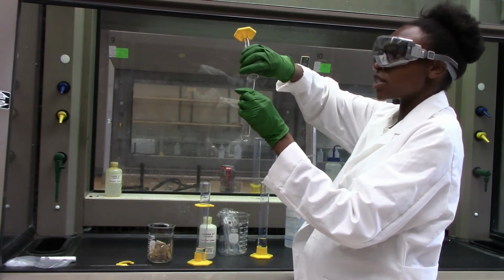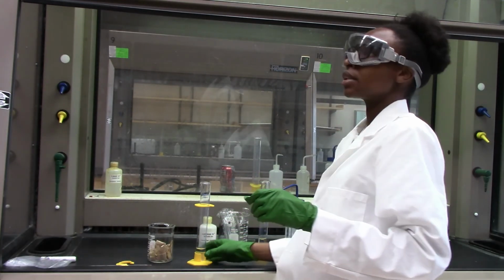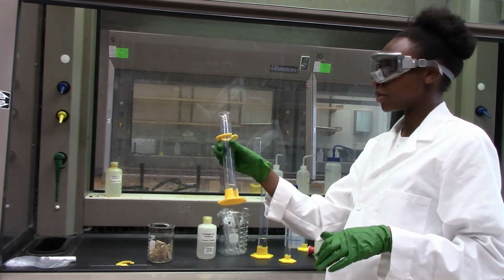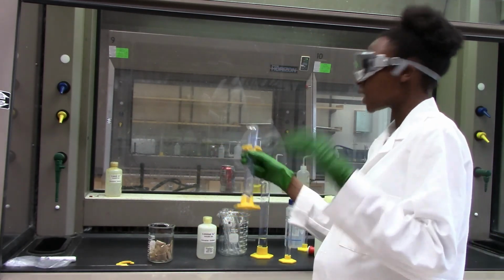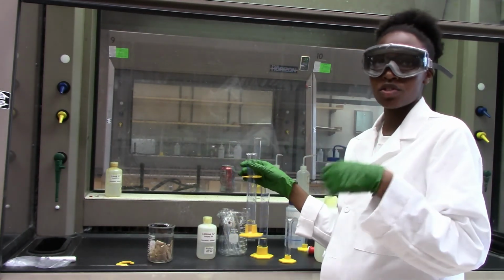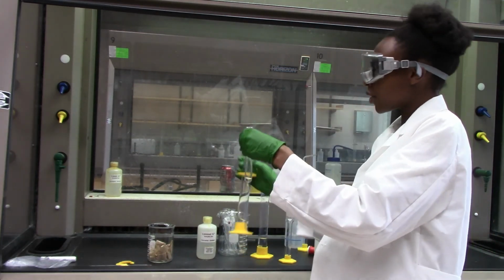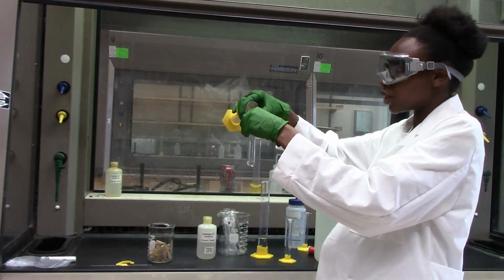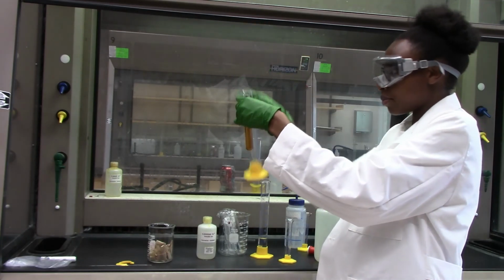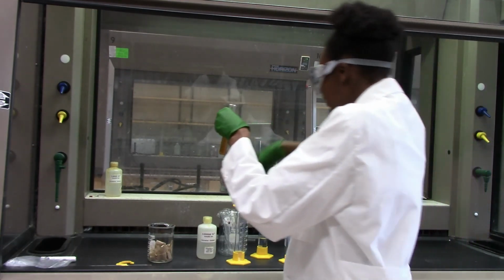that's marked standard solution, and then I will take 18 milliliters of 0.2 molar sodium ion. Sorry, not sodium, iron 3 ion. So this is 18 milliliters, and we have a very highly concentrated iron 3. So this is going to make all of our thiocyanate be converted to the iron thiocyanate product that we designed. So it has a color change, and this is our standard solution. Alright, so that's done.